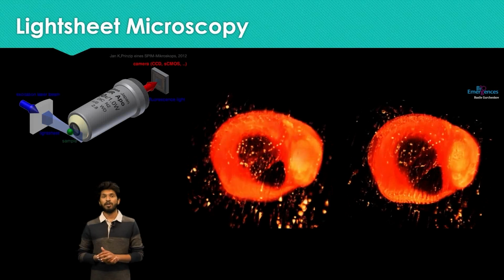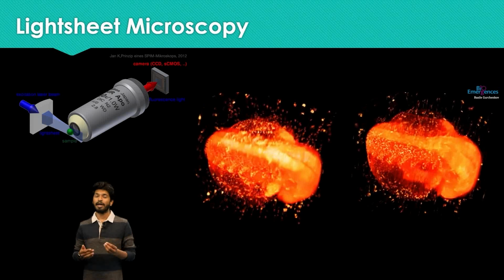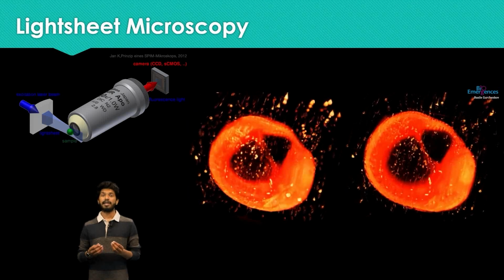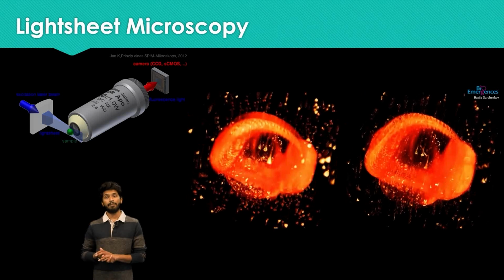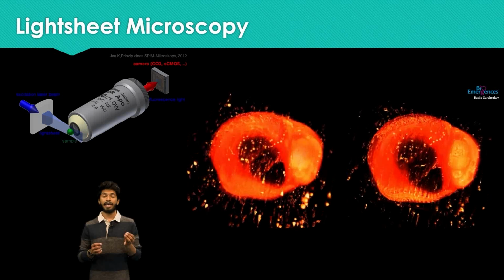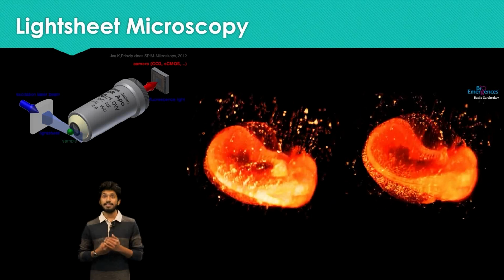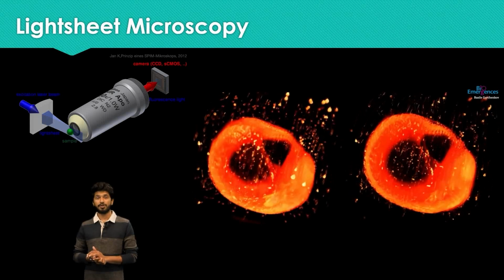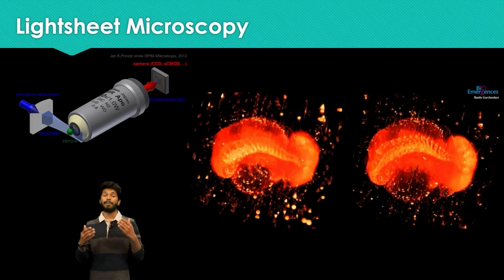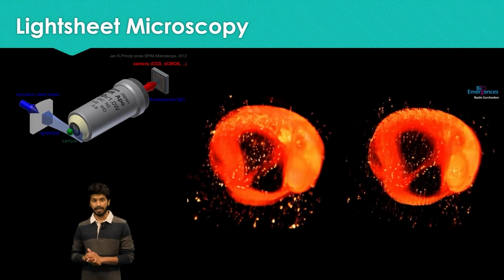Light sheet microscopy improves the speed of imaging as well, allowing us to image the sample at a much greater speed. The resolution of this microscopy is similar to a fluorescence or an epifluorescence microscopy and is dependent on the objective and wavelength used, as we will see later with the diffraction limit. This type of microscopy specifically also produces large amounts of data while having a few artifacts, like the appearance of stripes on the image due to obstacles in the path of the light.